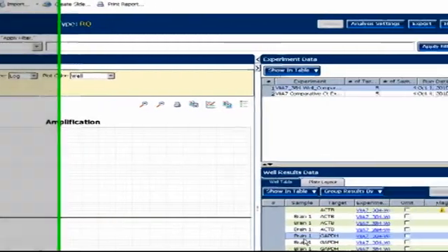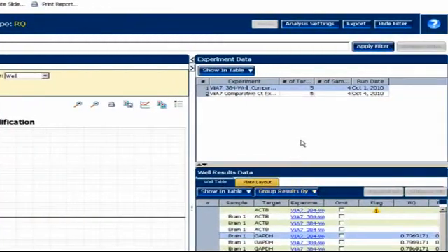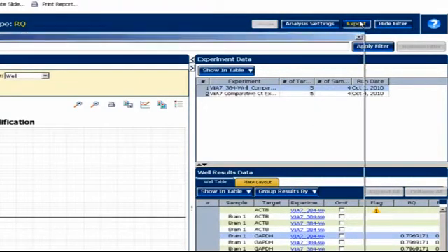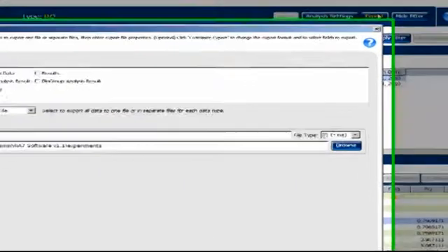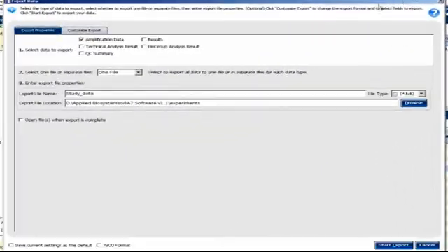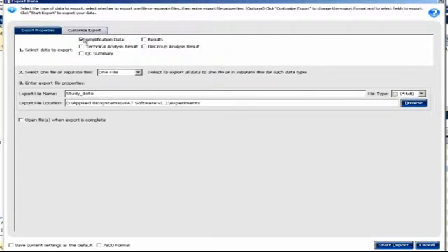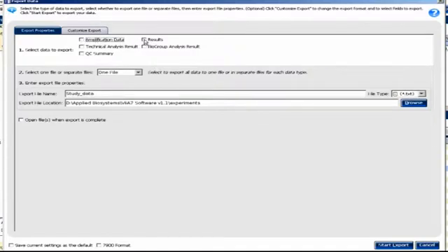From here, we can export our data by clicking the Export button in the top right of the window. We only need the results for importing into DataAssist, so uncheck Amplification Data, and check the box next to Results. Give the file a unique name, and choose a location.